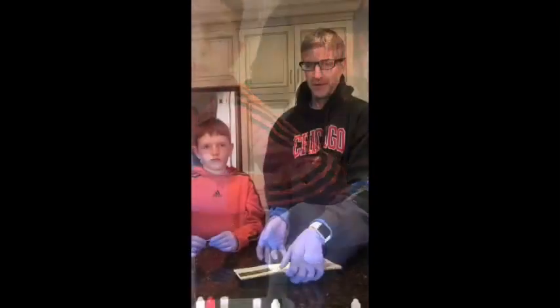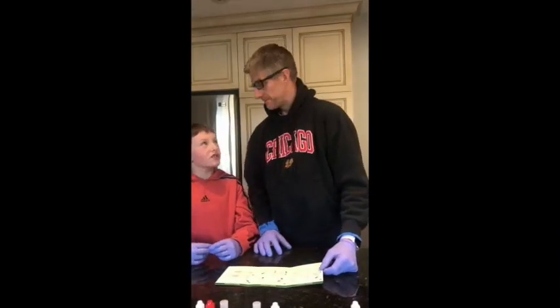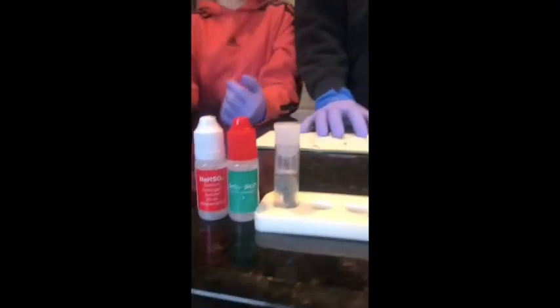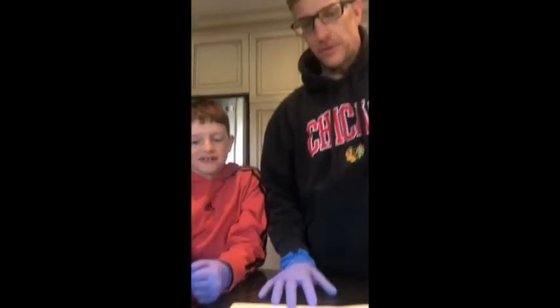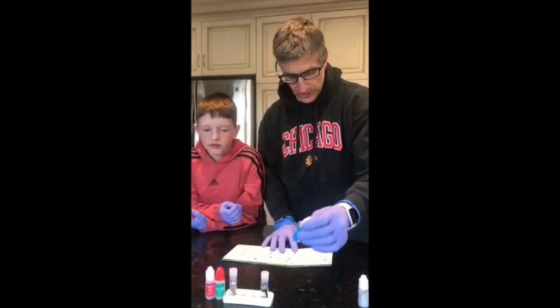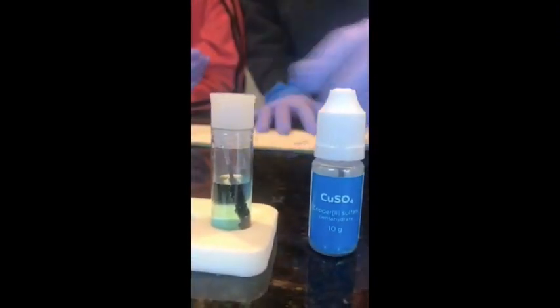Okay, we're ready. We're back, and we have finished the task of 15 minutes of this, both this and this. Okay, and now we're going to reveal the surprises. Just follow my lead, okay? So we're back, guys. Just a quick recap again. The first solution has copper 2 sulfate mixed with 4 mils of water, and it's caused a reaction.